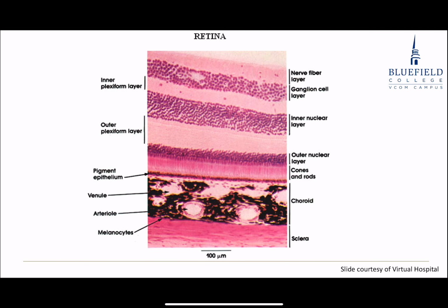All right, I'll look here. The thing that jumps out at me first is the choroid. Okay, see that? That must be sclera down here. Just above the choroid here, that must be my layer of pigmented cells. Which means here's where the photoreceptors are for my rods and cones. Here's nuclei of rods and cones, nuclei of bipolar cells, nuclei of ganglion cells up here. This layer up here would be my axons, my ganglion cells, that form the optic nerve.